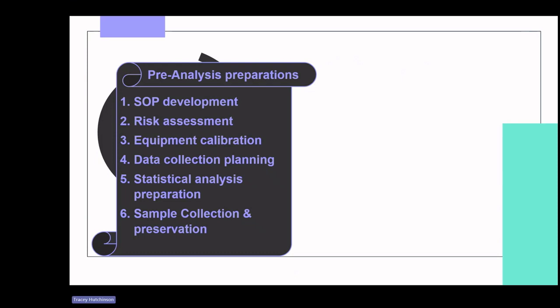You would step forward and discuss the importance of planning data collection strategies, including the selection of relevant microscopic fields, the identification of target microorganisms, and considerations for capturing images. You would introduce students to the basics of statistical analysis, emphasising the importance of planning for statistical tests during the microscopic analysis phase, and discuss considerations such as selecting appropriate tests, determining sample sizes, and aligning statistical methods with research objectives.